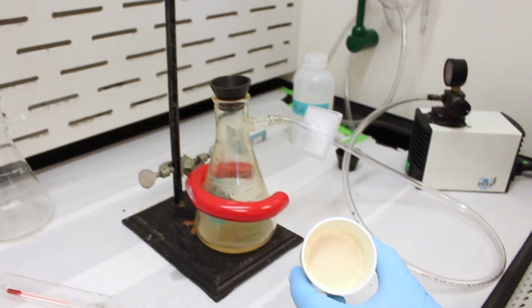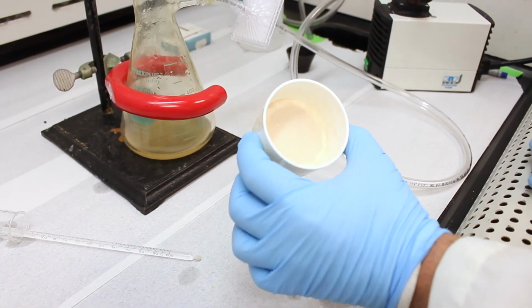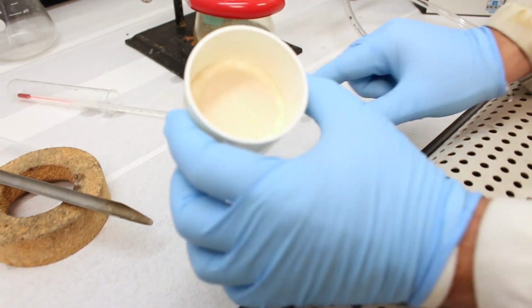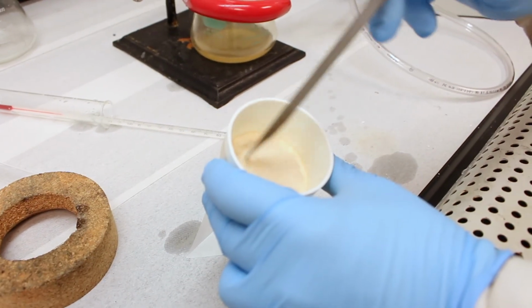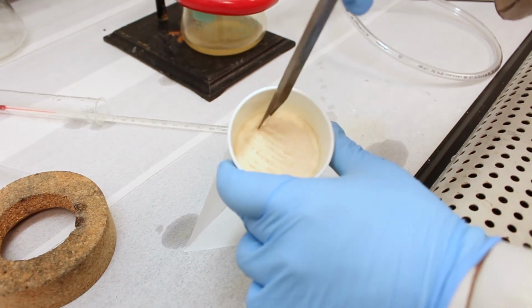So you can see some off-white crystals there. The product should be a white solid. This one has some color in it, indicating that we have some impurities. So what I'm going to do is take this weighing paper here, and we'll scrape out the crystals. So just dab that water off. We got our spatula here. So right now it's a very pasty solid because it has a lot of water in it.